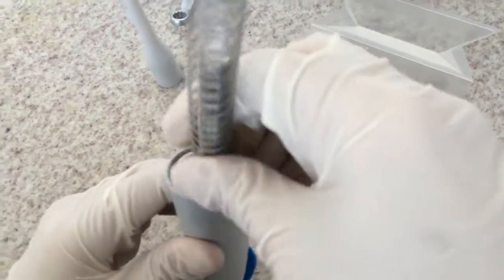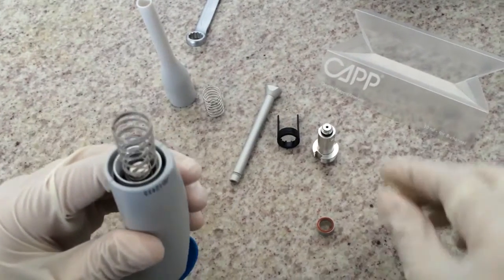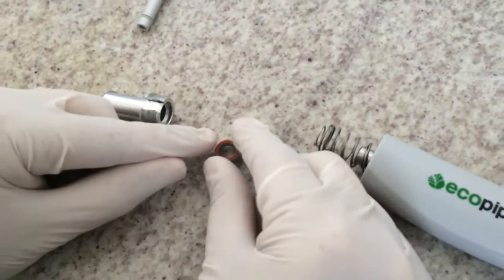Put it back on the pipette. Make sure that the o-ring is properly fit into the seal.